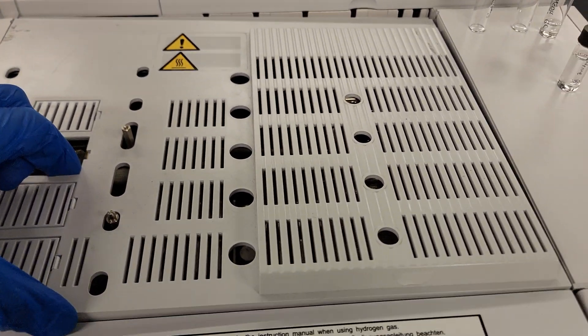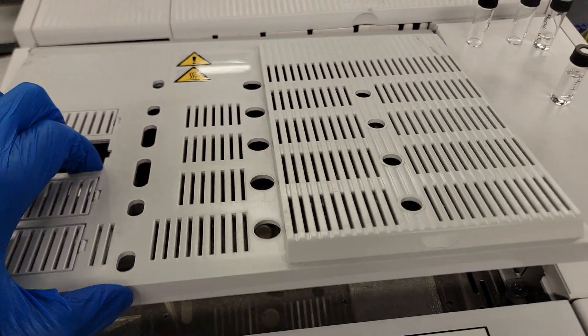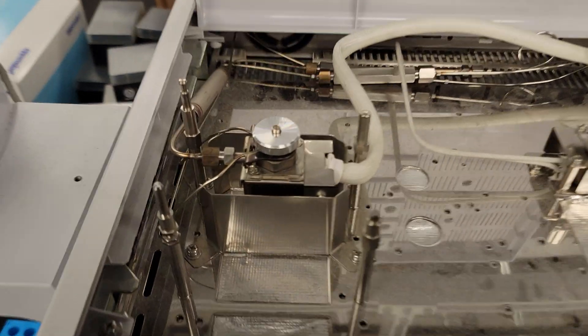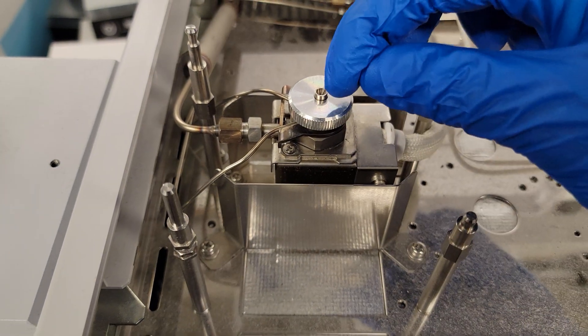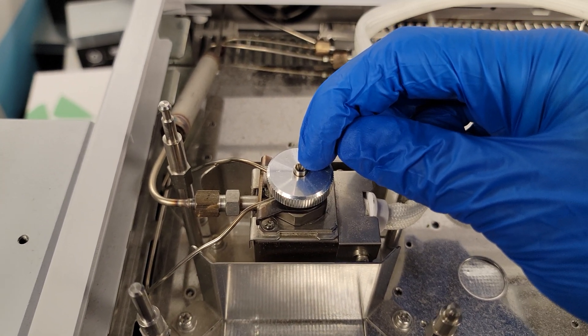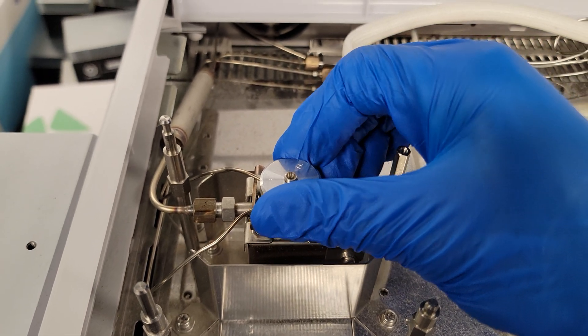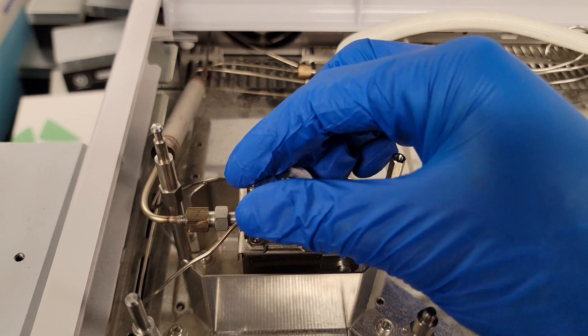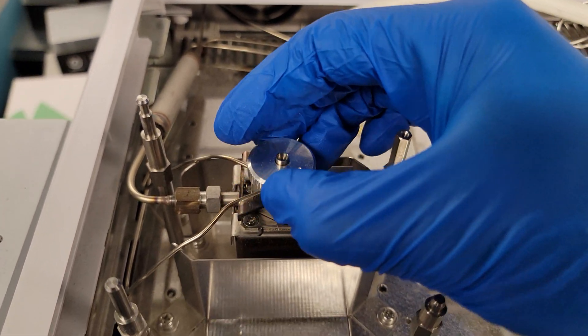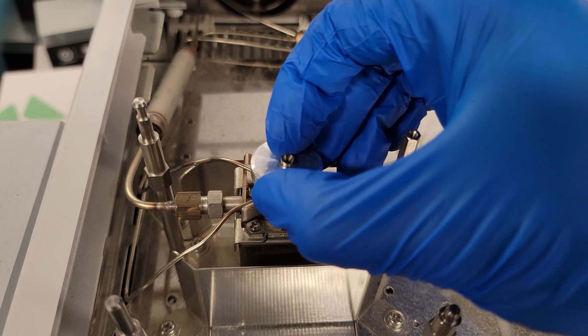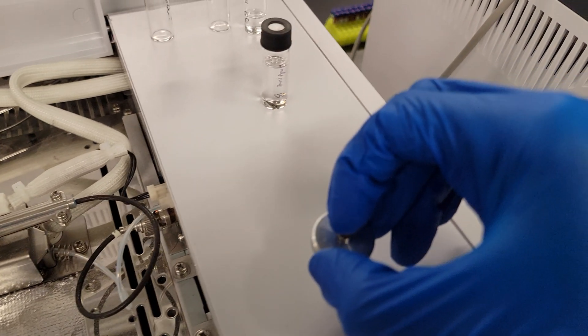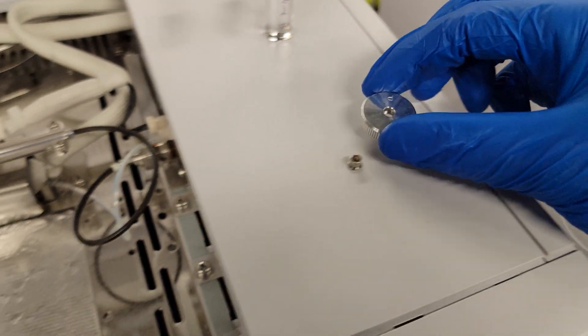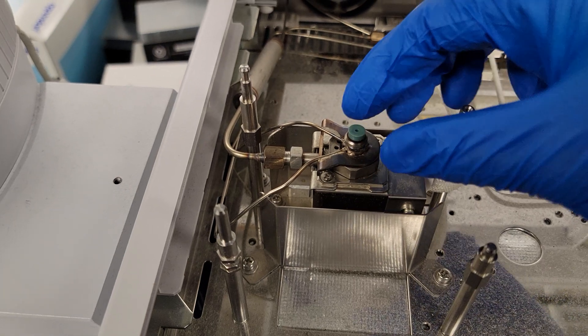There's this little tray that can lift up and sit up like that. This is where everything is going to go. There's this little piece right here that can easily fall out and get lost in the machine. You can undo this by hand. When you put it back on it's just going to be hand tight. I'm going to push it to the side of my finger so it stays in the nut, and very gently set that to the side. Those are two separate pieces and you don't want to lose that inner piece.